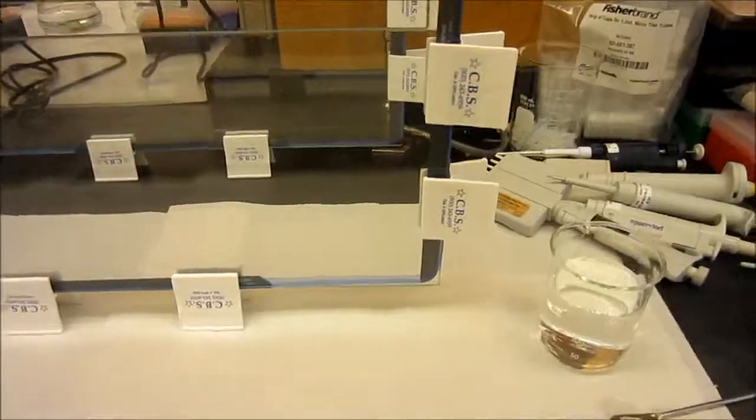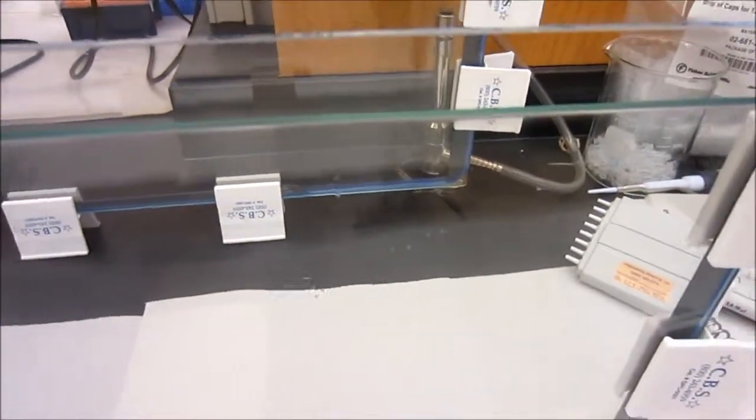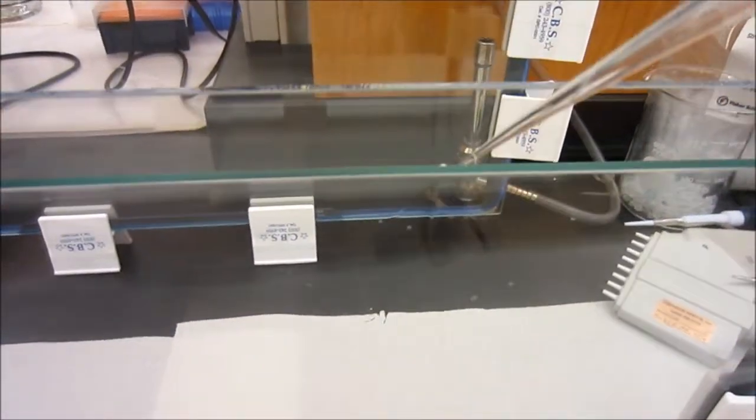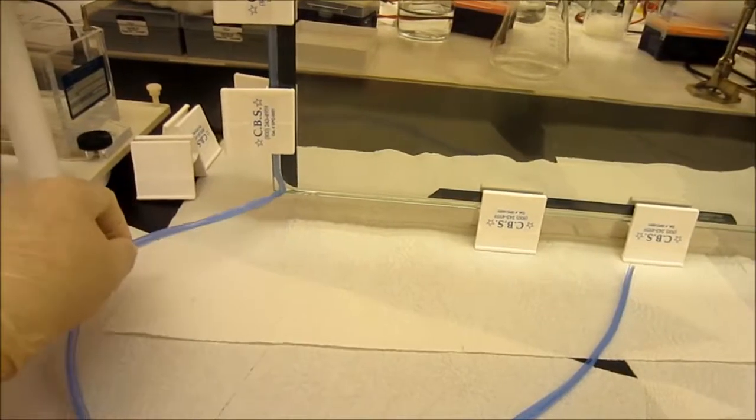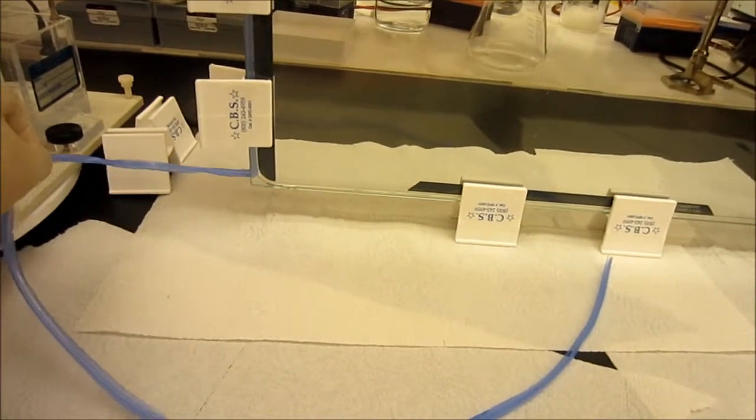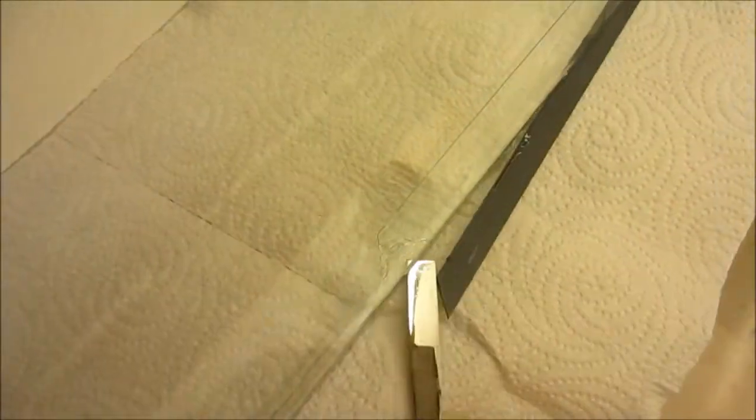In this step, the gel solution is poured or pipetted into the glass slide. After letting the gel set for 45 minutes, the gasket and bottom spacer are pulled out from the glass slide.